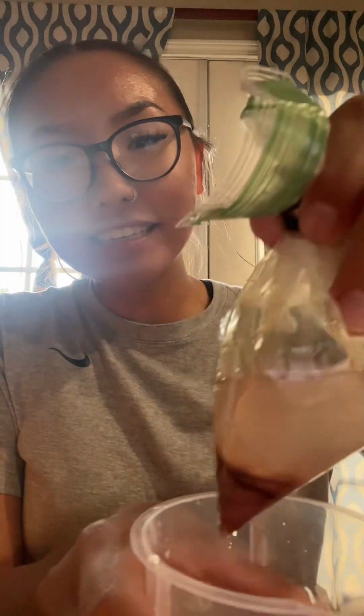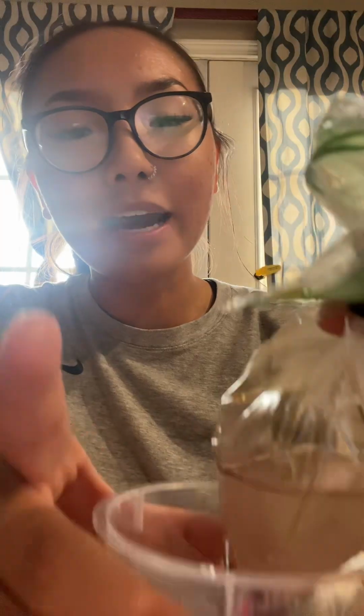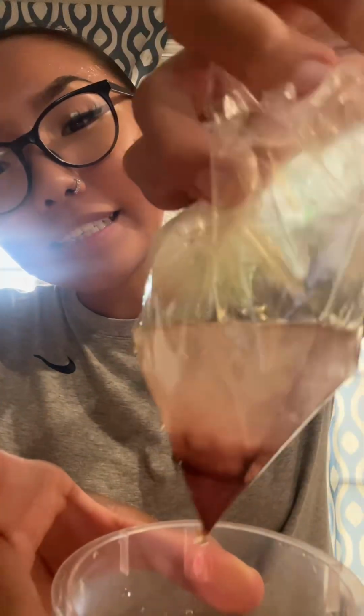Okay, fast forward to like an hour later, I looked at it again and it actually did do something. So it did turn purple, but this stayed the same color as well. So as you can see, the cornstarch solution didn't go through, but the iodine solution did go through the bag, if that makes sense. But yeah, here's how it looks. And now I'm gonna start on the next experiment, which is exercise 2, osmosis.